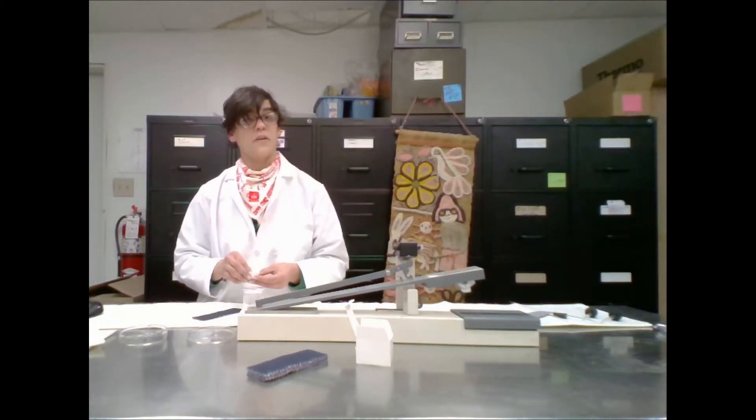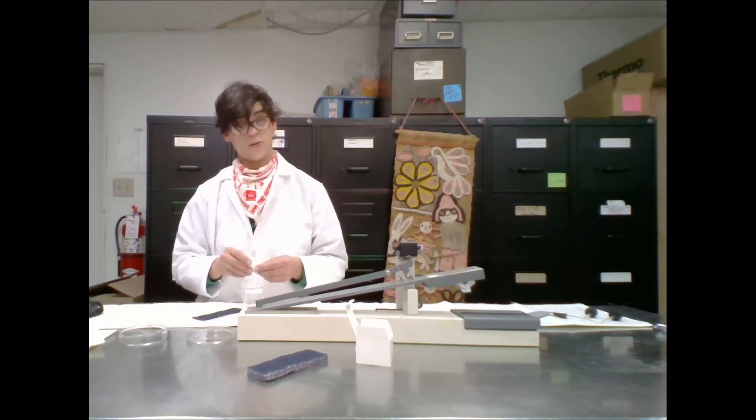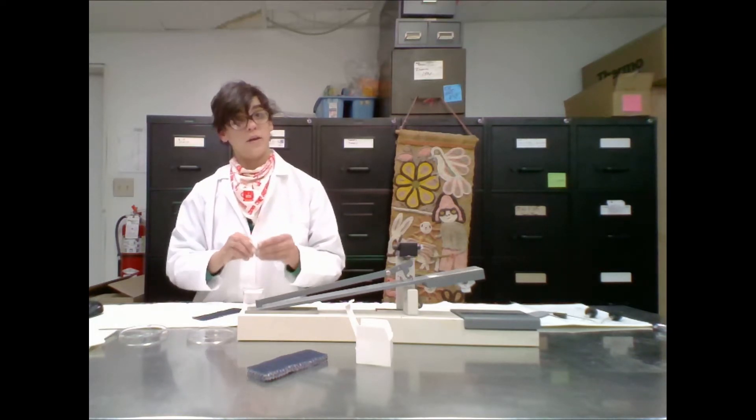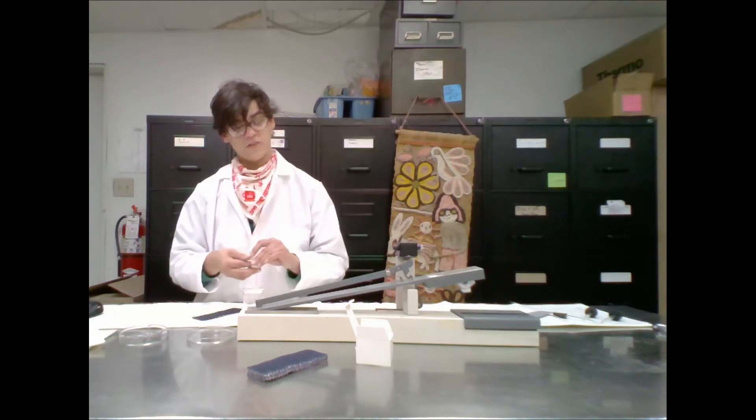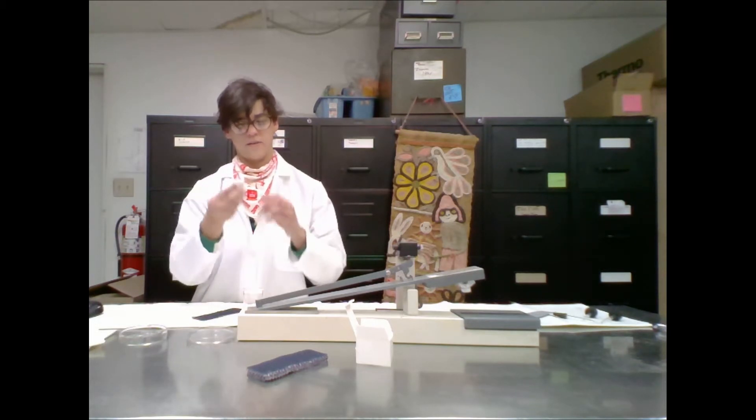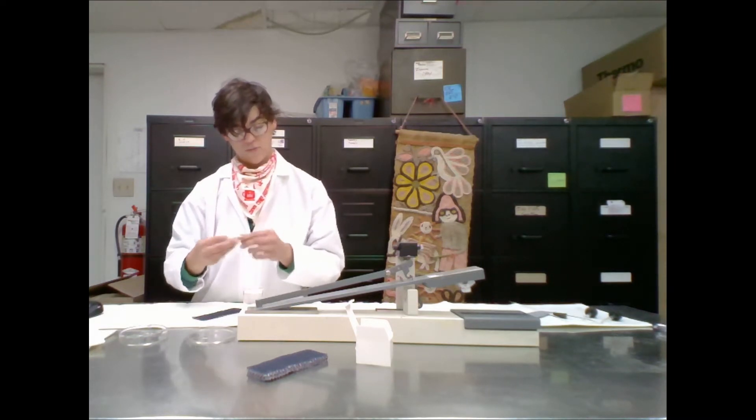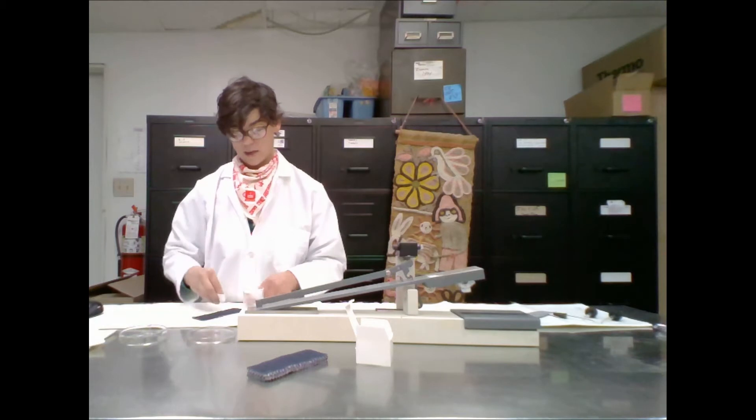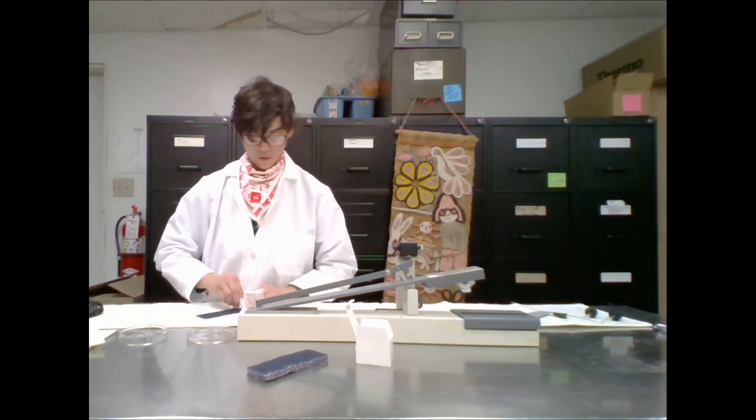A rubbing finger is the basis of the Croc Meter Test. According to dye house lore told to me by my dad, the dyer, once the newly dyed fabric was processed and dried, took his finger and wrapped it in a clean white cotton fabric. And then he would rub this fabric against the newly dyed fabric to see if color would transfer.